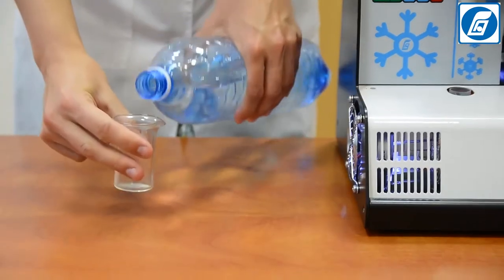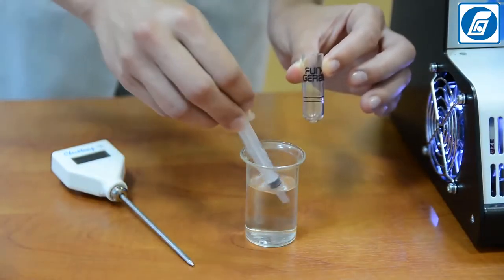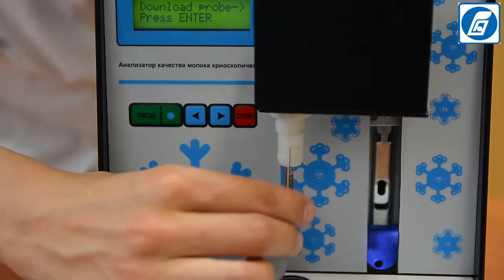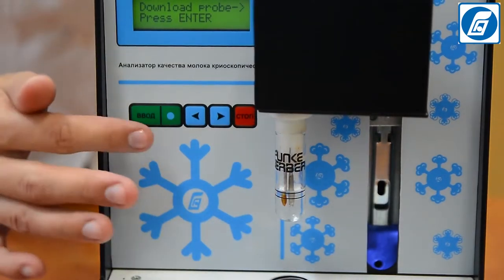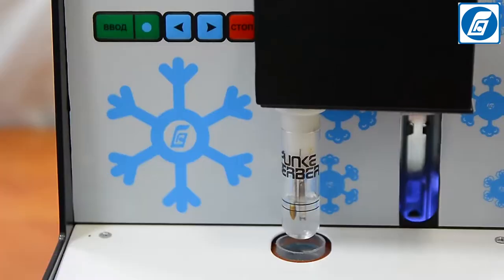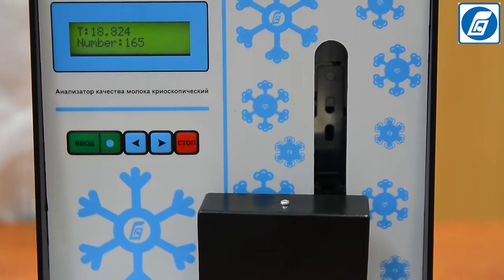Repeat the operation to obtain five measurement results, each time filling a dually washed and dry test tube with the same standard solution. If the absolute error of the freezing point does not exceed 0.004 degrees for any three of the five measurement results, the analyzer is ready for work. Otherwise, the analyzer is to be calibrated again.